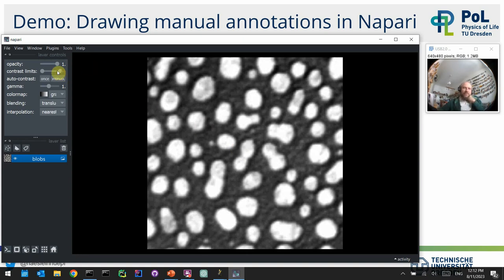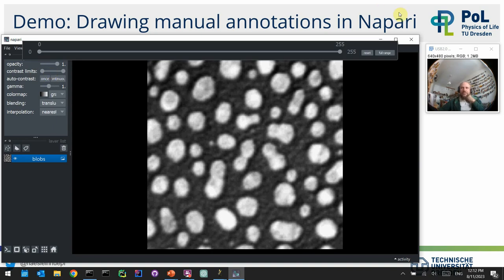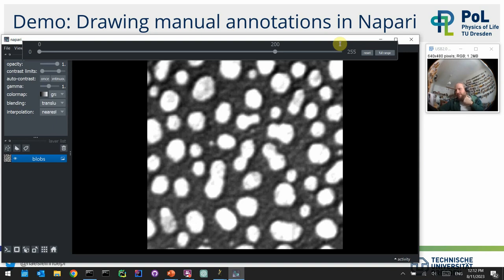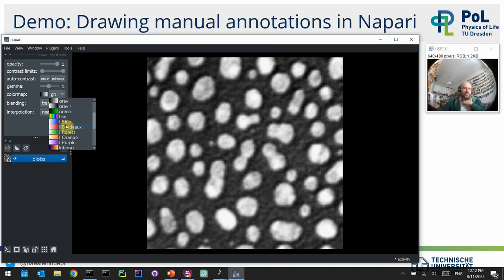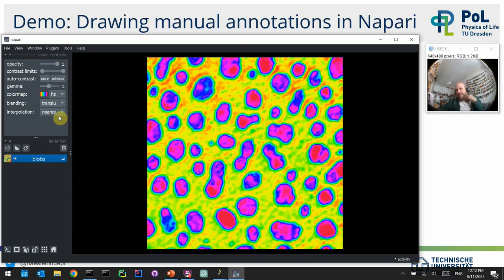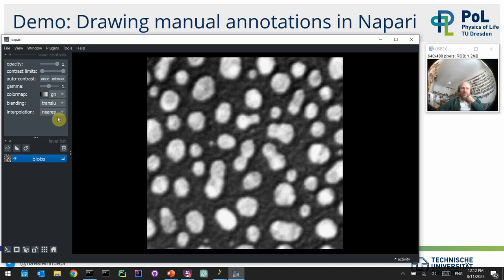Once loaded, you can configure brightness and contrast as just shown — using the right-click menu on the contrast limit slider to enter numbers. For example, if you want the maximum shown intensity to be 200, you can enter that number. You can also change the lookup table; for example, you can do something fancy with different colormaps. Changing the lookup table does not change the image itself, just the visualization.